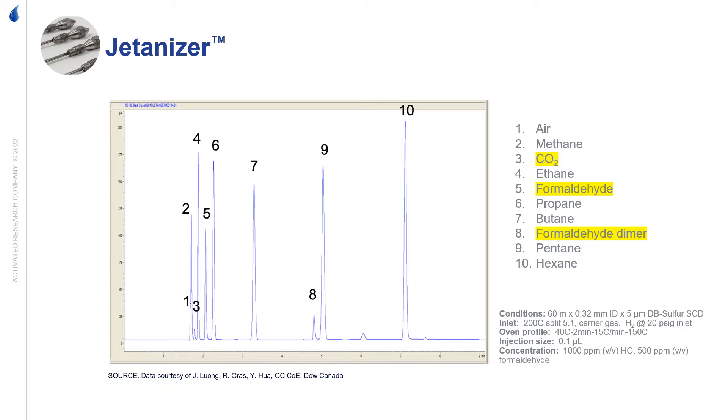This chromatogram depicts a typical sample analyzed with the Jetanizer. It has CO2 along with other hydrocarbons. Formaldehyde will have a significant increase in response from the methanation. The Jetanizer, however, cannot handle compounds larger than hexane.